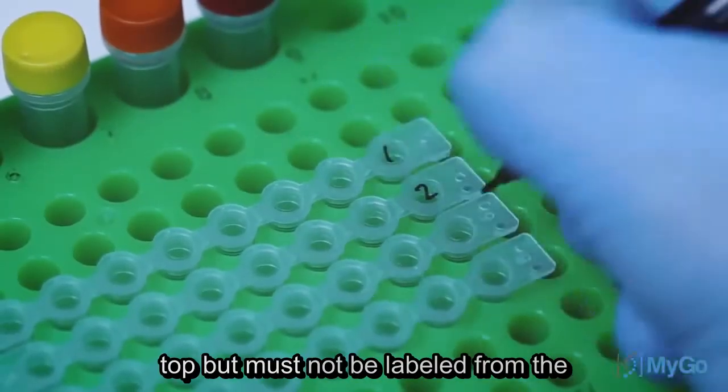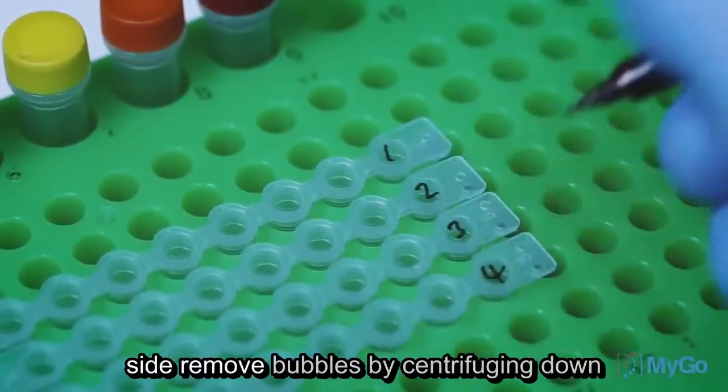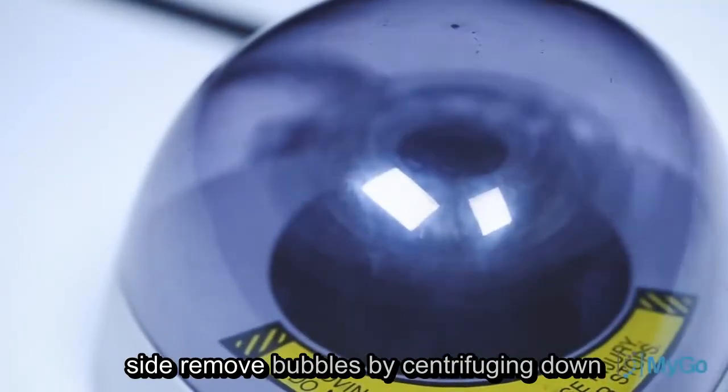Strips can be labelled on the top, but must not be labelled from the side. Remove bubbles by centrifuging down the strips.